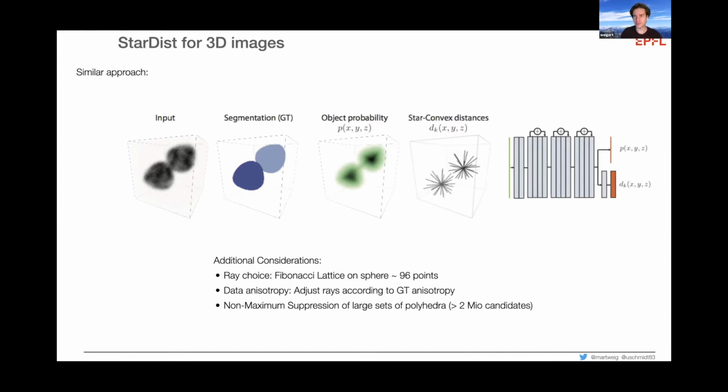So it's calculated for every pixel, because even if you're not in the center, if you're close to a membrane or close to a border of an object, towards that border you have a pretty good notion of what the distance is, but not in the other direction, right? So even for those pixels, you can calculate this distance. But they're typically not used if the center probability prevails. You do that for every pixel, and you get a center probability for every pixel, and at the end, you choose for every pixel what is the most likely and only use the distances of those. But all of them get predicted. And they then get stitched together.